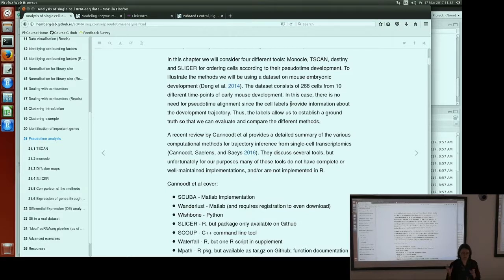And so comparing the snapshot of the cell population at each time point can be very difficult and very noisy, because you have cells that are actually at different stages in the developmental progression at the same time point. So here the goal is to align the cells based on how far they're making it through that process, as opposed to what actual time point you saw them at.